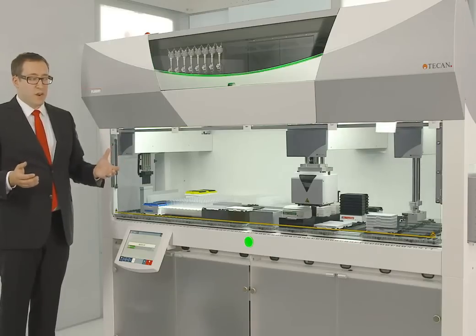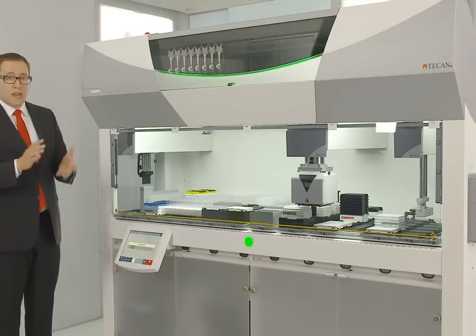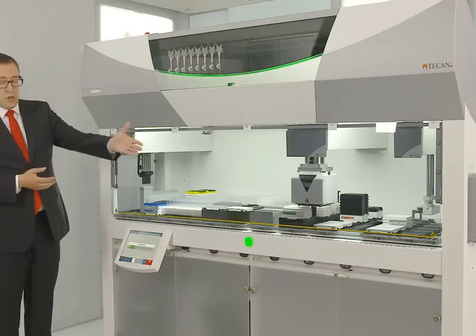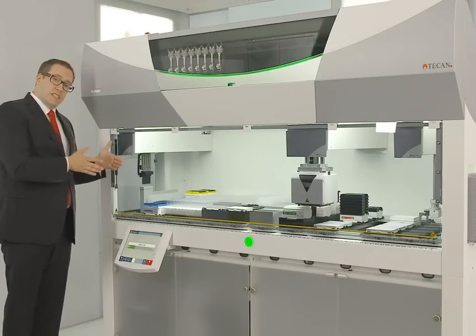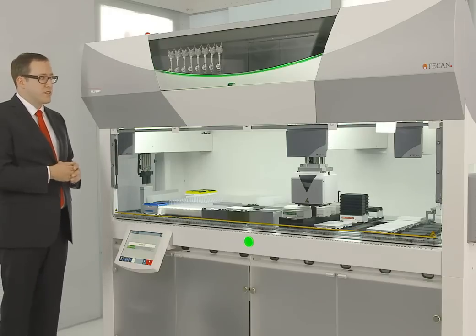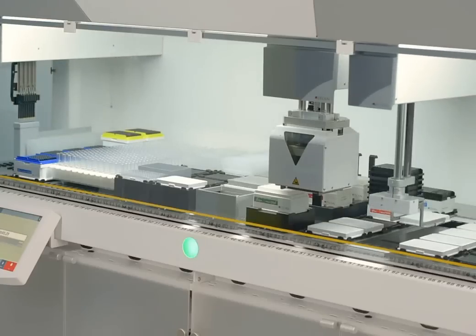This is the robotic gripper arm. Here we have it manipulating a stack of plates. So if you had a compact instrument, say without hotels on the edge or a peripheral device, you could do things like this to save space on the work table and deal with stacks of plates and send them across the work table and restack them up when you need to have more pipetting positions. Or you can take a plate through the work table to an integrated device.